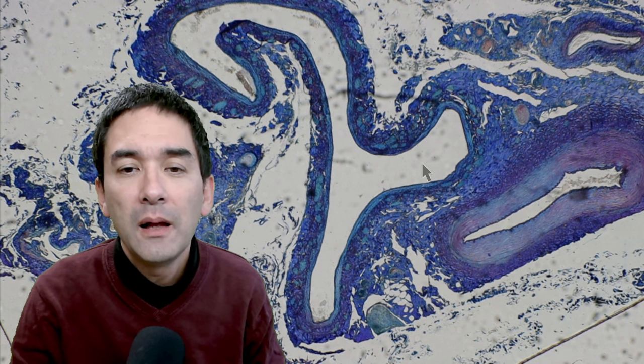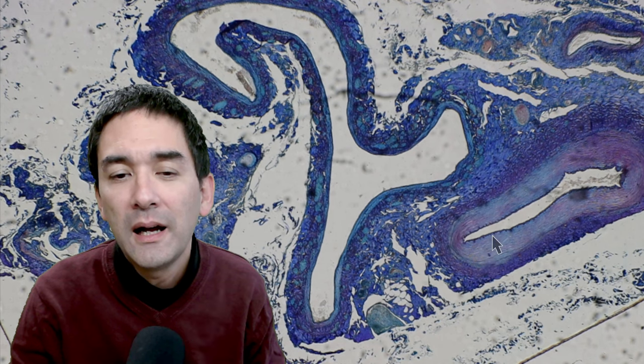Over here, this is the vein. And this one over here is an artery. Just look again at the thickness of the wall. Significant difference here.